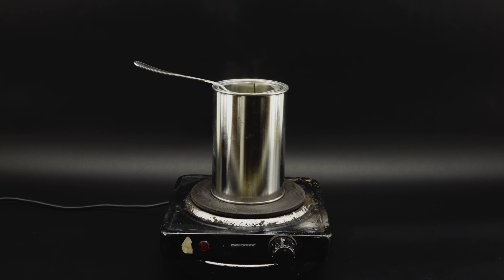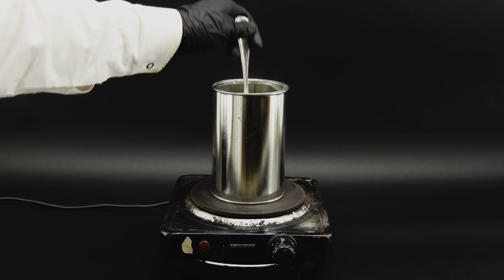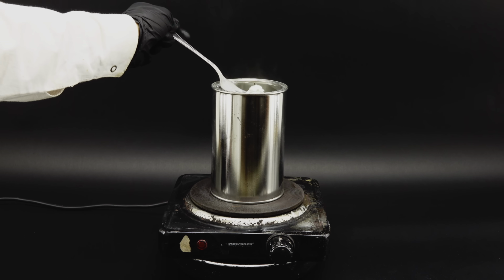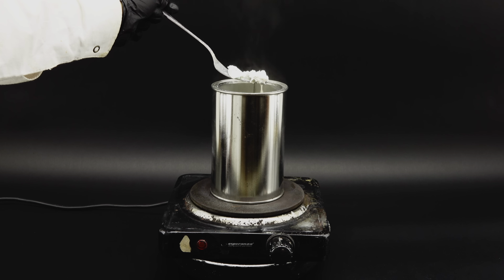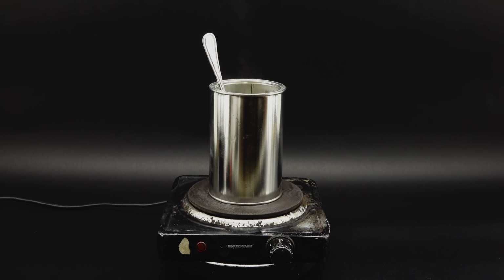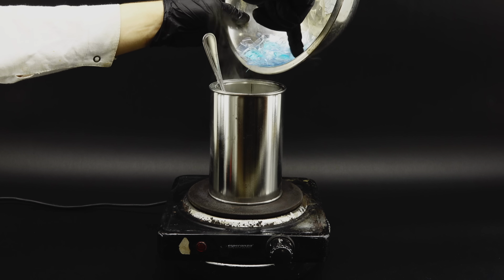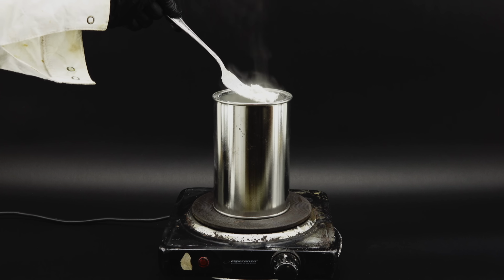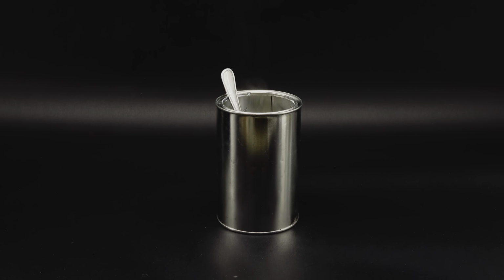Under such severe heating and an excess of sodium hydroxide, this reaction proceeds quite quickly, and you can actually see that as the whitening and eventual crumbling of the plastic chunks, which turn into this white sludge. Anyway, under my watchful eye, this reaction seemed to go much better than before, and it was not long before I added in all the plastic and most of it dissolved. I then took this forbidden recycling soup off the stove and allowed it to cool down.